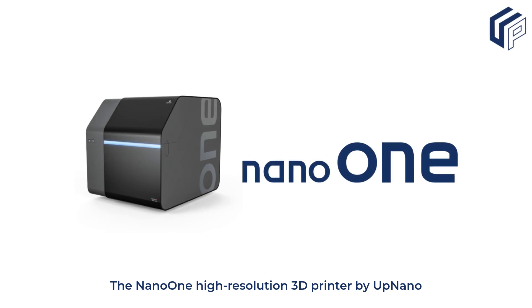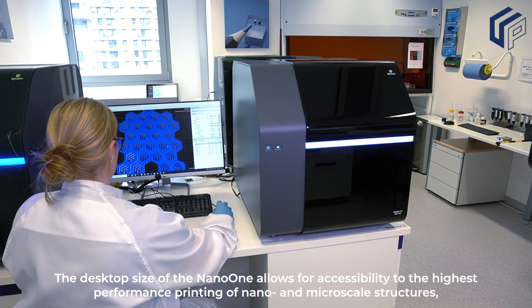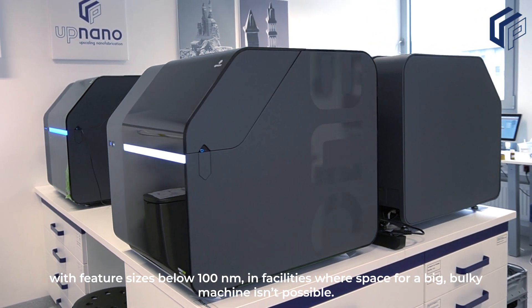The Nano One High-Resolution 3D Printer by UpNano. The desktop size of the Nano One allows for accessibility to the highest performance printing of nano and micro-scale structures, with feature sizes below 100 nanometers in facilities where space for a big, bulky machine isn't possible.